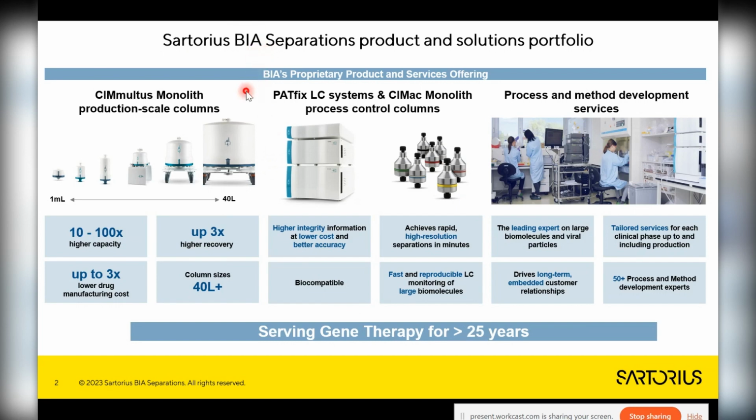Our main area of work and development is monolithic columns, which were developed for gene therapy purposes close to 30 years ago.